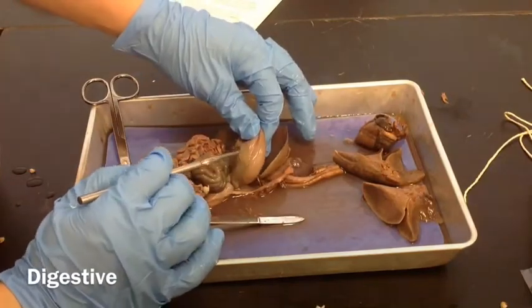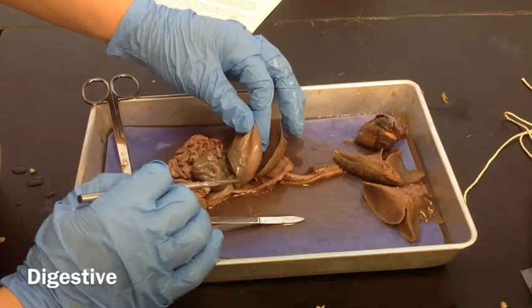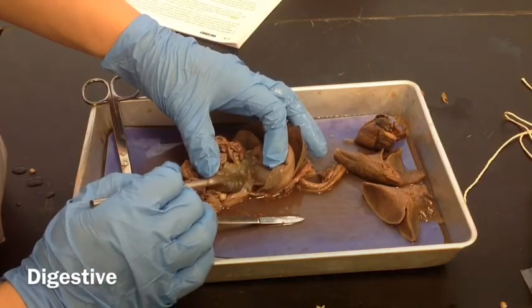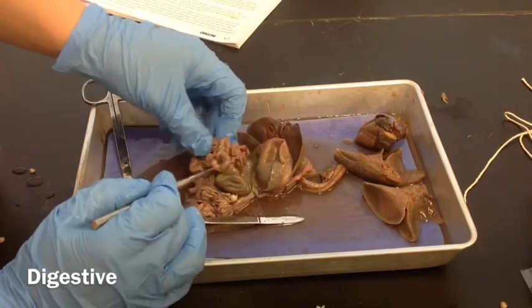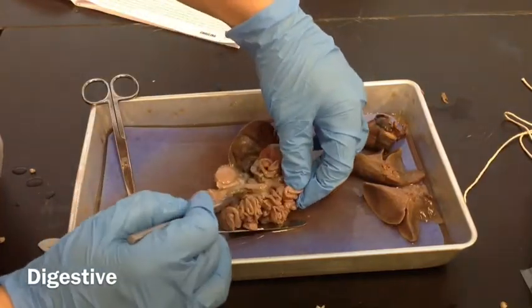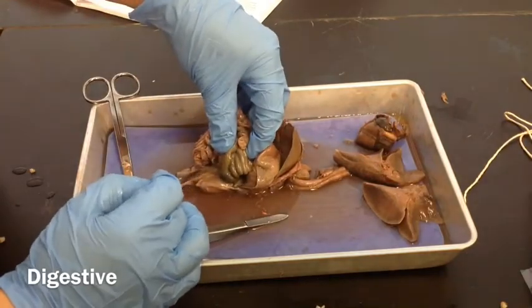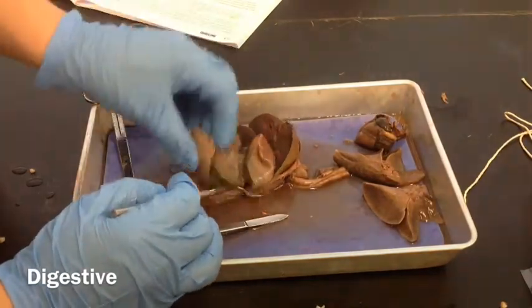We have the spleen that's on the left side of the stomach. Behind that there's this real mushy kind of tissue — that's the pancreas. And then we have small intestines, a whole bunch of small intestines. Behind the small intestines we have the large intestines, the cecum, and all this that goes to the rectum. This is the rectum. So this is the digestive system.